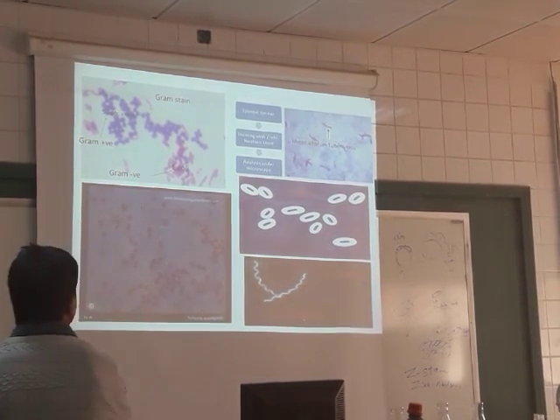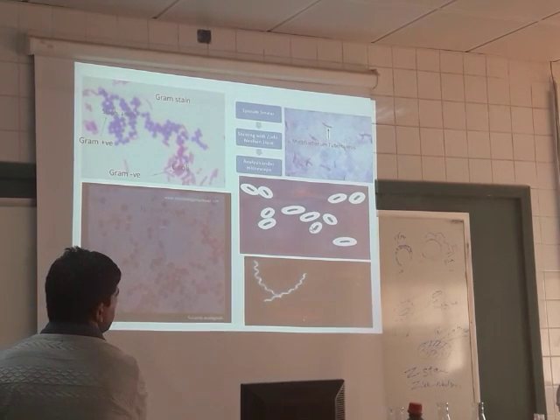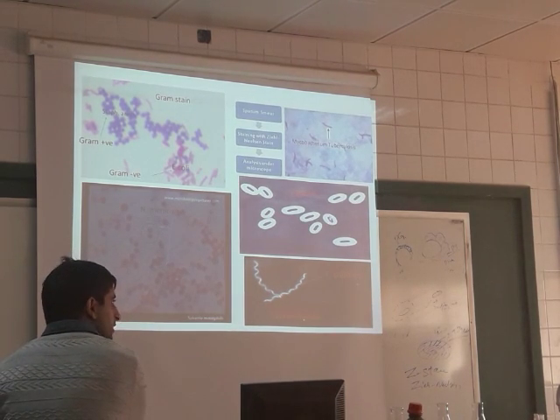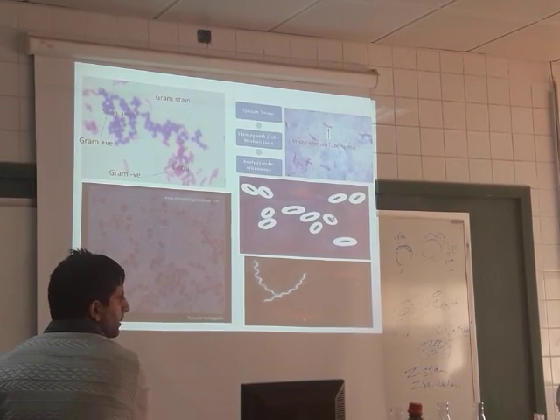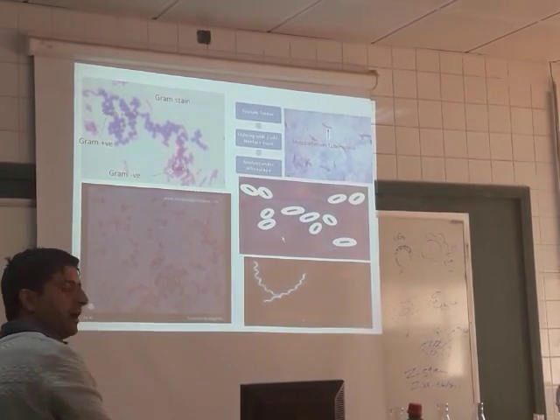For example, here, what is this? Identify this slide. Acid, negative stain. So identify the, give one example. You can give one example and you can say it's negative stain. Fine?